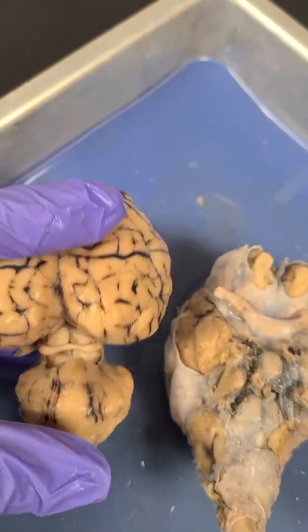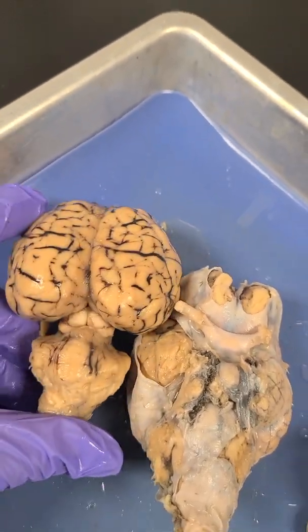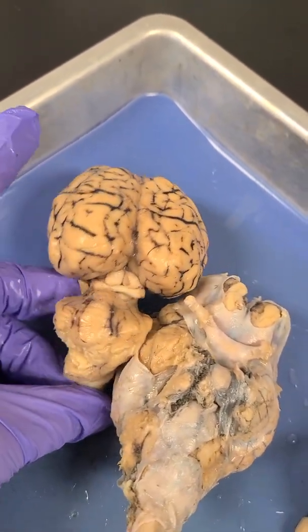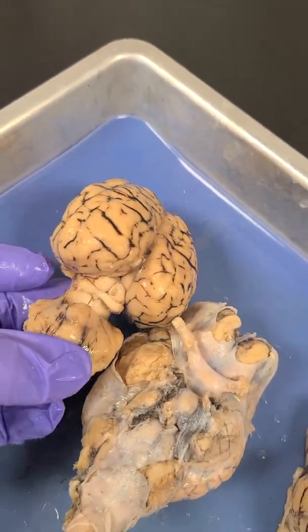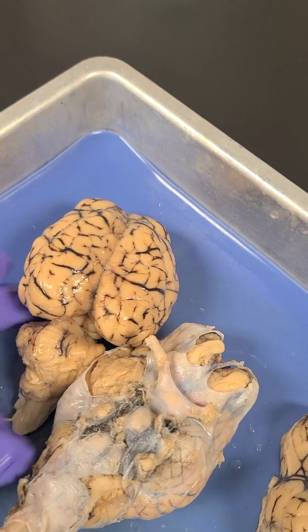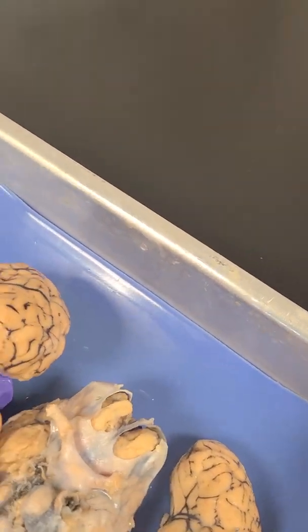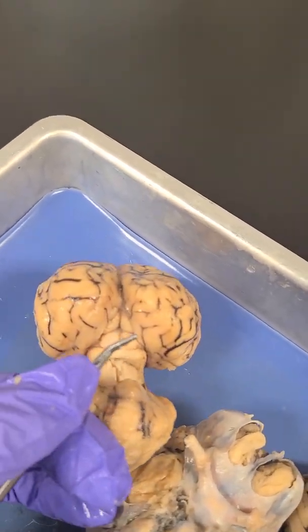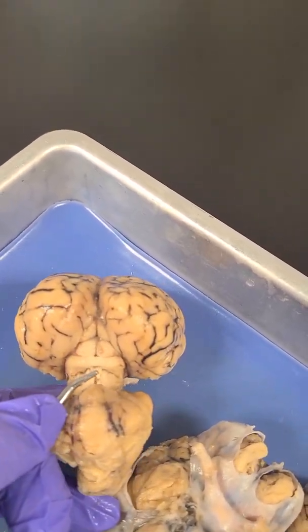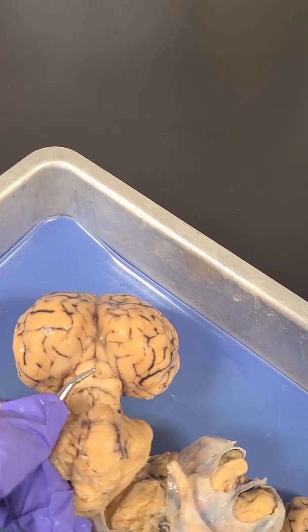So I've turned it over and pulled the cerebellum down. It's hard to do with one hand. The superior colliculi are at the top, and the inferior are right below them. If you have directions, they kind of look like little booty cheeks right there. The superior one is the bigger, fatter one that looks like booty cheeks, and then right here are the inferior colliculi.